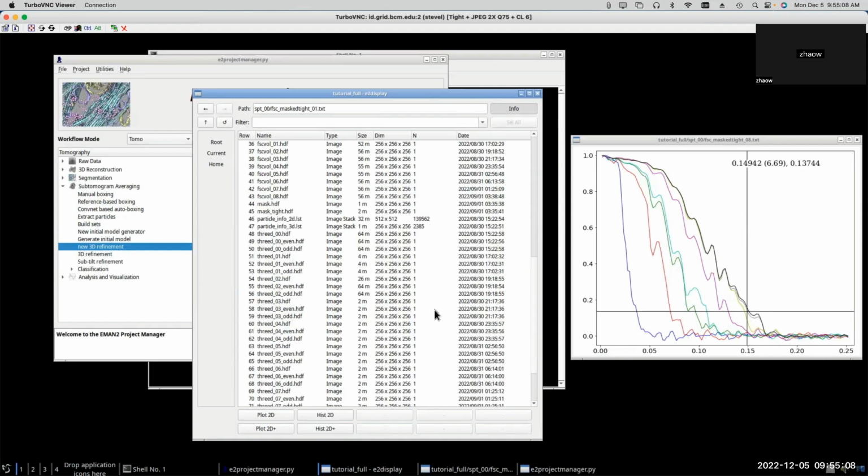Does 2D alignment also update any of the orientations in 3D? Your 2D alignment doesn't impact the 3D orientations directly, but it impacts where the particle is translationally in the subtilt series. If you've done your tomogram alignment and pull out a subtilt series, but say one of the tilts is shifted by 10 pixels to the left or something, because the alignment was done on the whole tomogram and it's not perfect. Near the edge of the tomogram, maybe it's a little less well aligned.